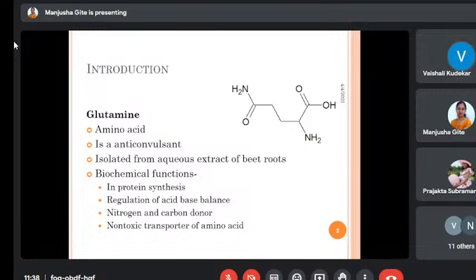Okay, good. Range of amines is between 3200 to 3500. In primary amine, if you observe carefully, there are 2 protons. You will get a doublet. What is meant by doublet? In IR, there are singlet, doublet, medium peak, sharp peak, weak peak, broad peak. Doublet means the main peak is split into two. In primary amine, there are two protons, so you will get a doublet.